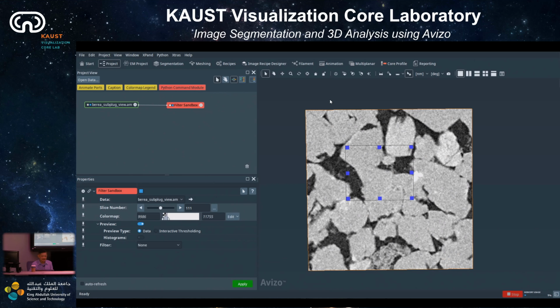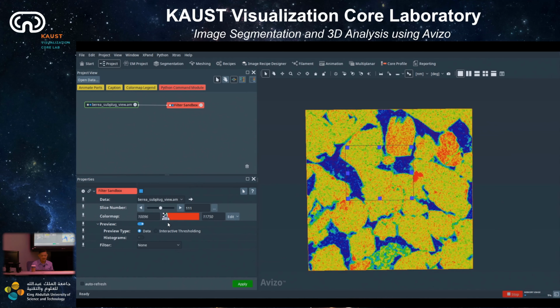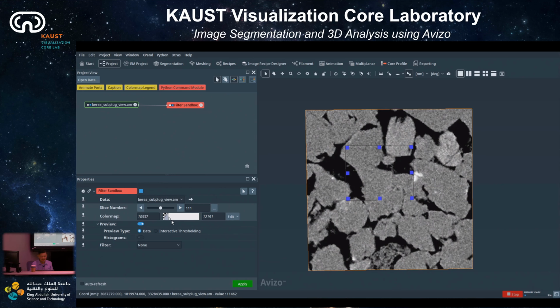And you can also manually adjust it, of course. One thing you can do as well is change the color map of this dynamic range. For example, if you click on edit, you can see on the bottom row they have a list of color maps you can change to. If I change this color map to physics, you can see something like this. And adjust the dynamic range again. You can choose any color map you wish and adjust the dynamic range. But for filtering, I think it doesn't matter which color you use, it makes more sense to use grayscale and then adjust the dynamic range a bit.